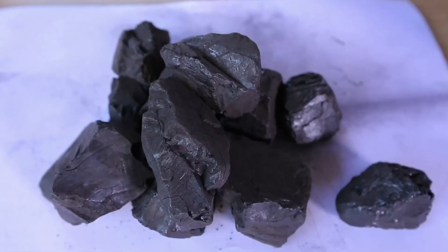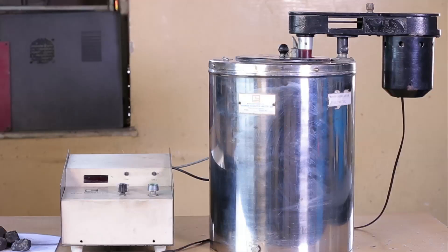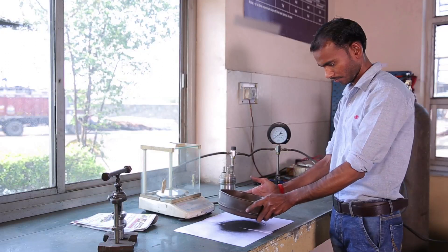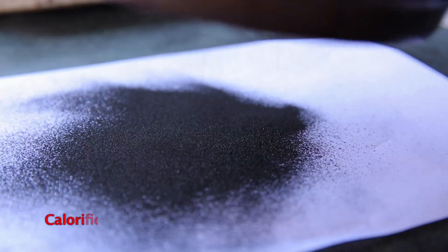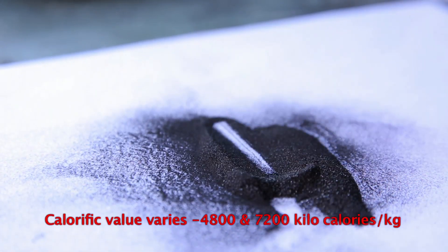The calorific value of any fuel can be determined in a laboratory using a bomb calorimeter. Generally, the gross calorific value varies between 4,800 and 7,200 kilocalories per kilogram.